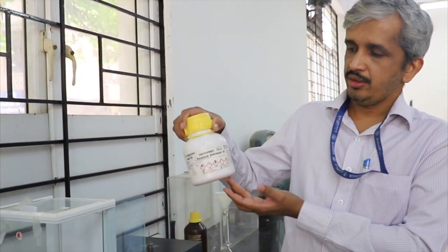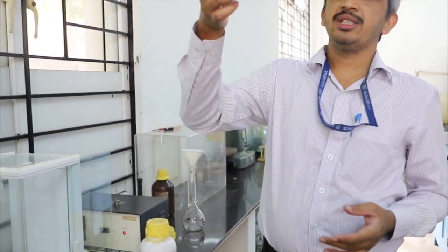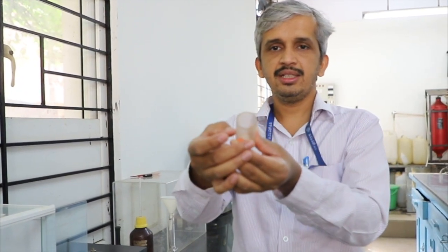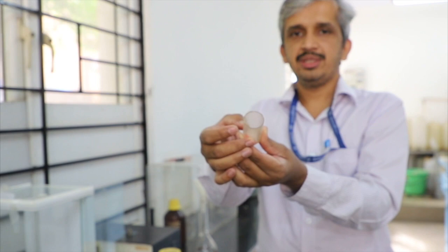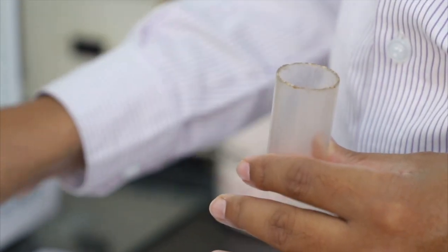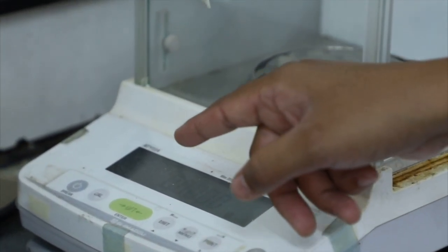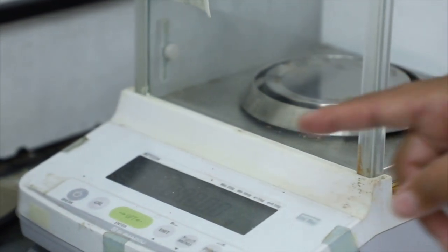We have potassium dichromate here. I have taken a little bit of potassium dichromate in this weighing bottle. This is a plastic bottle. Inside you can see there is orange colored substance, or orange colored crystal, that is potassium dichromate. Now you can see this is the weighing balance. It gives accurate weight up to 4 digits, 0.0000, and it is now in grams. It is now tared, that means the weight here is 0 gram.